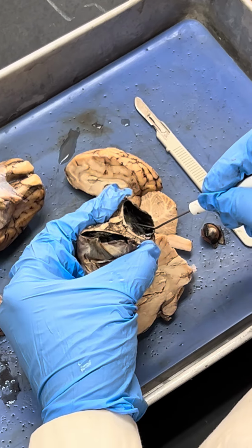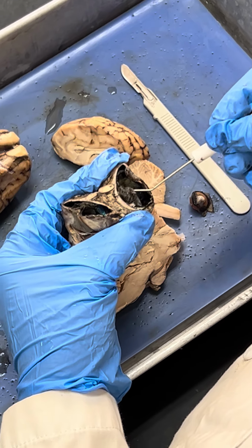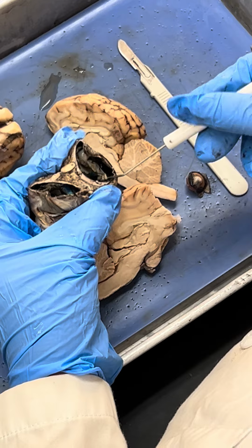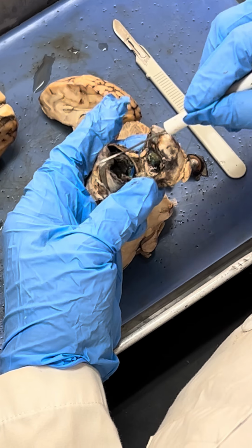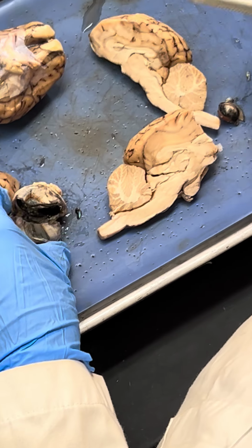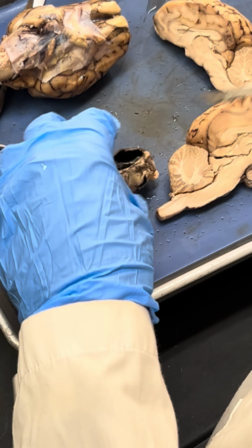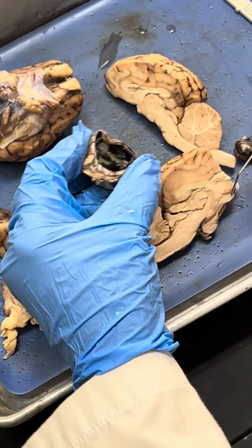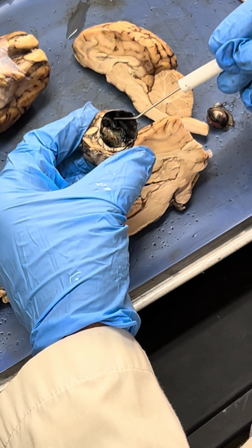This brown, or basement-like, very thin, can you see this? This is the retina. This is the retina, brown one, okay? Let me cut it down. So if the question is, what's the name of the brown beige color membrane? What should you write? Retina.